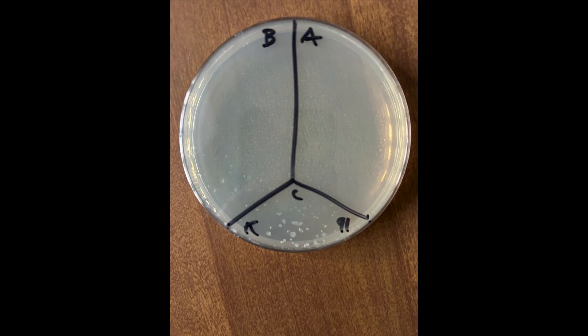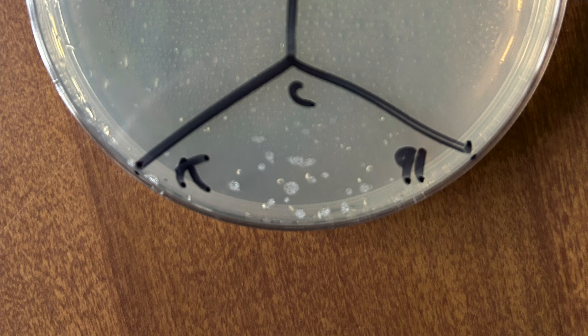Now for some results. Let's look at the kitchen floor first. I want to show you that the petri dish I used had some imperfections on it. So what I did was mark it out so that the control section was where the imperfections were, so that it wouldn't visually disrupt the results. In the control area you can see a lot of bubbles and imperfections — I deliberately put that section in the control area.